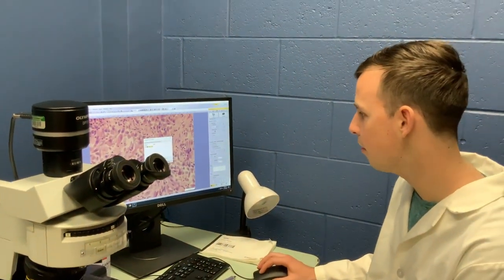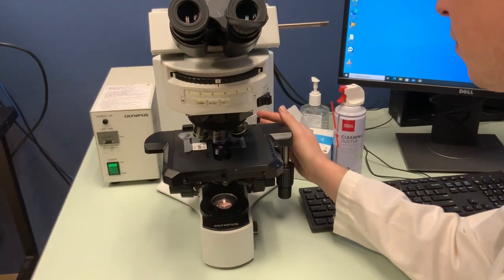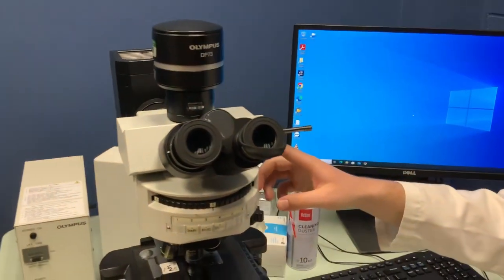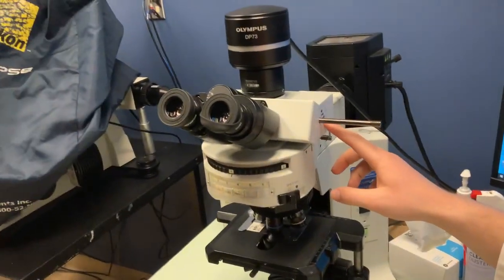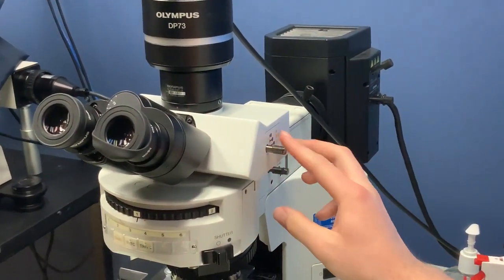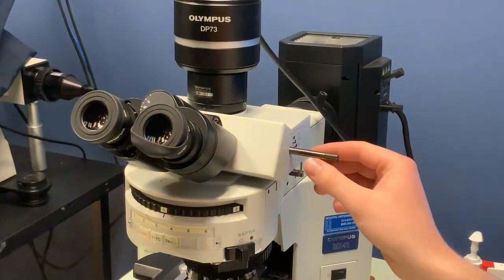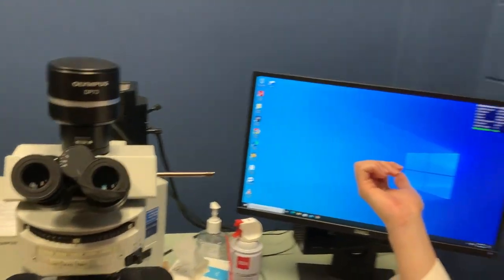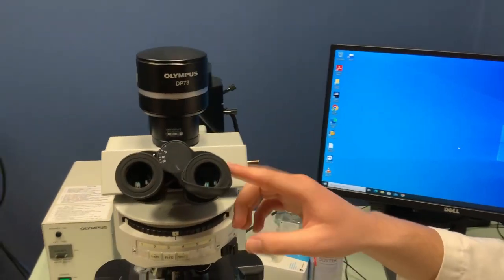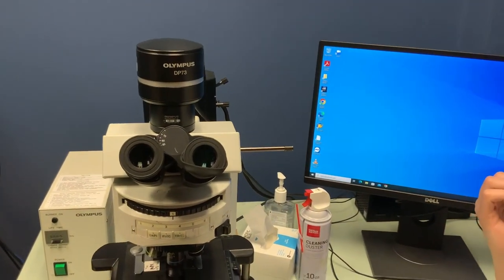I'm going to shut this down and not save. We turn the switch back off on the microscope. One other control I neglected to mention: to go to the eyepiece, we have this little pictograph that shows the options. If we push this peg all the way in, it will send light to the eyepiece and to the camera. Pulled all the way out — which is how I had it set to look through the computer — sends it to the camera so you can see it on the computer.